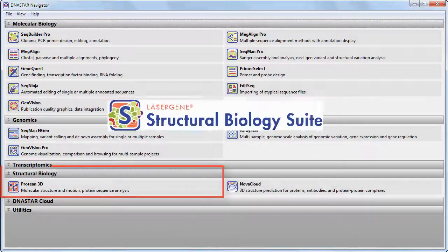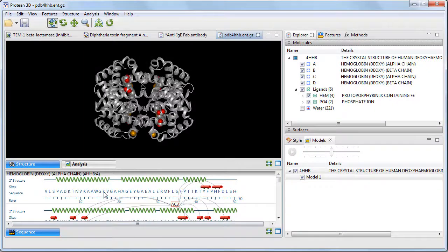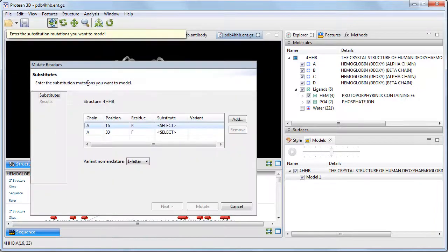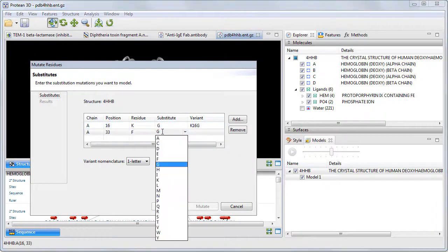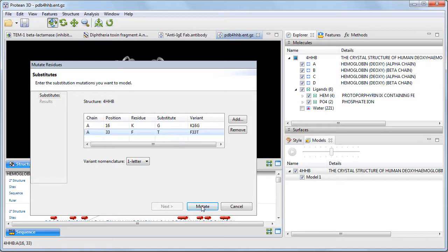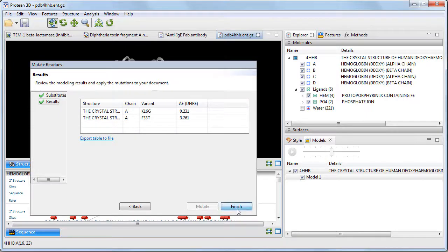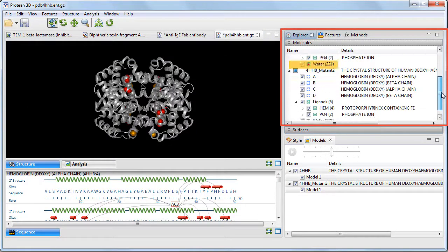Protein3D, part of LaserGene's Structural Biology Suite, can now show you the impact of an amino acid mutation on a protein structure. Simply select one or more sequence positions of interest, use the Structure Mutate Residues command, enter the substitute values, and the finished results can be seen in the Explorer panel.